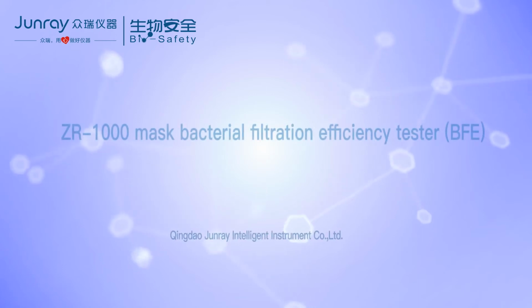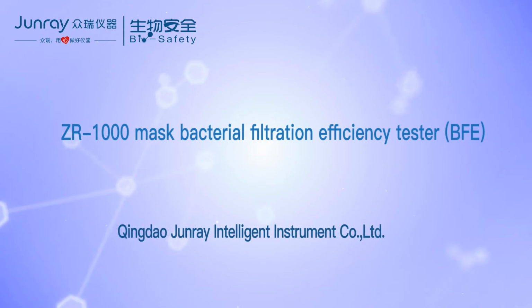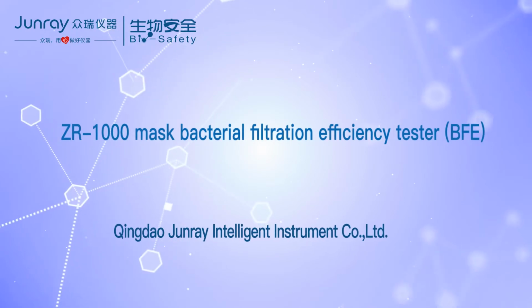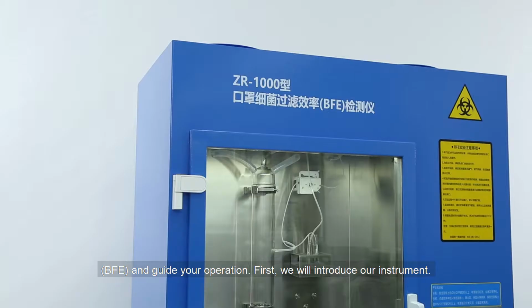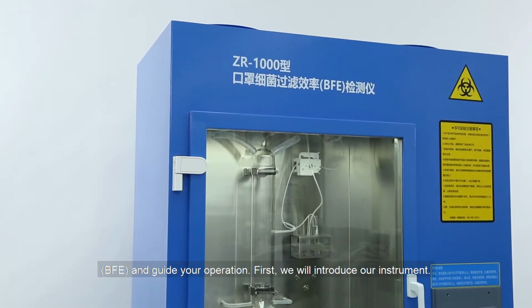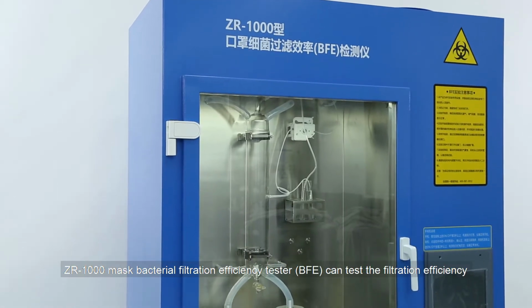Hello everyone, for your convenience in understanding the instrument, we prepared this video to introduce the ZR-1000 Mask Bacterial Filtration Efficiency Tester, BFE, and guide your operation. First, we'll introduce our instrument.